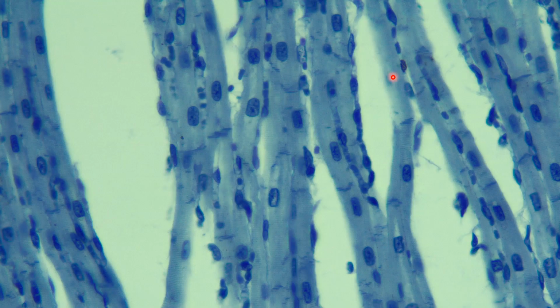Now for the next one, we have cardiac muscle. Cardiac muscle is located in the heart, so its purpose is to pump and circulate blood when it contracts, as well as maintaining blood pressure. Now, how do I know that this is cardiac compared to skeletal or say smooth muscle? Well, one way is the nucleus. The nucleus is going to be in the center of those cells, so it's not skinny and off to the side like we just saw with skeletal. We see these big round nuclei.